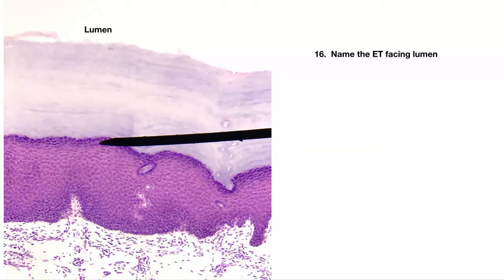Number sixteen. Name the epithelial tissue facing the lumen. Don't pay attention to the pointer — just look at the epithelial tissue and make sure you give me the specific one shown here.